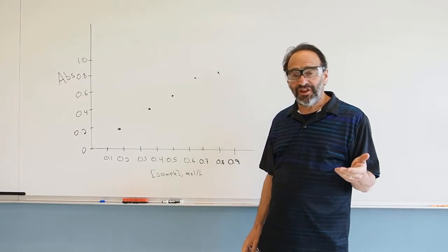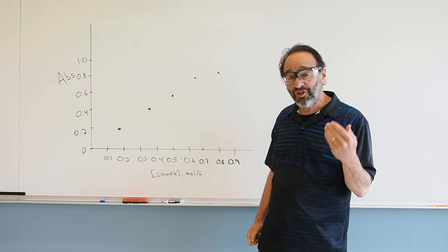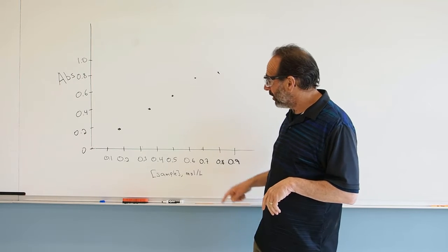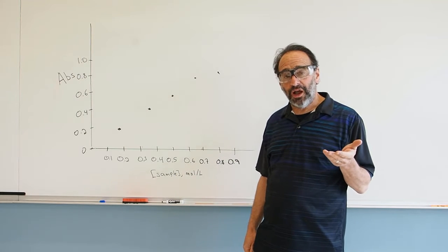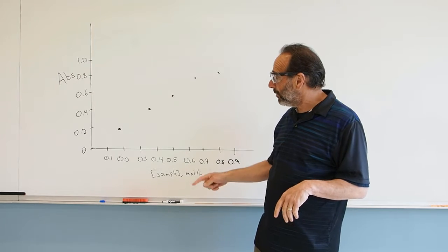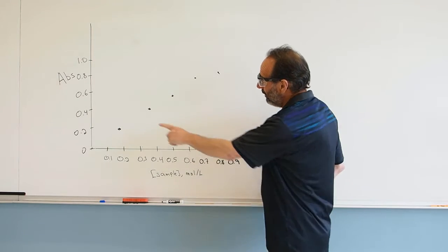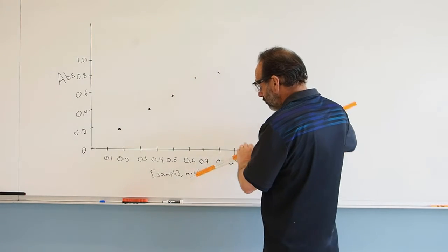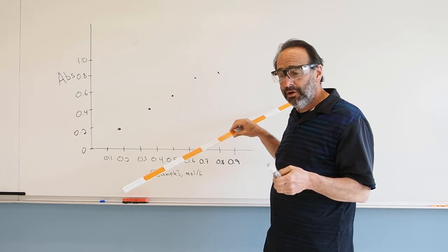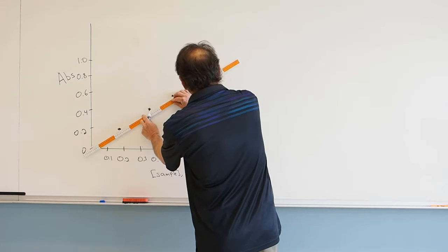And the standard curve is the same kind of thing. Once you make the standard curve, you can analyze thousands of samples using that curve to figure out their concentrations. The way it works is you measure your standard solutions, for which you know the concentration, and measure their absorbance. You make a plot of absorbance on the y-axis and concentration on the x-axis, and here are the points we get from that. Then you draw a straight line that goes through those points. We know it's a straight line because of Beer's law, where we know absorbance is proportional to concentration. So you draw the line through those.